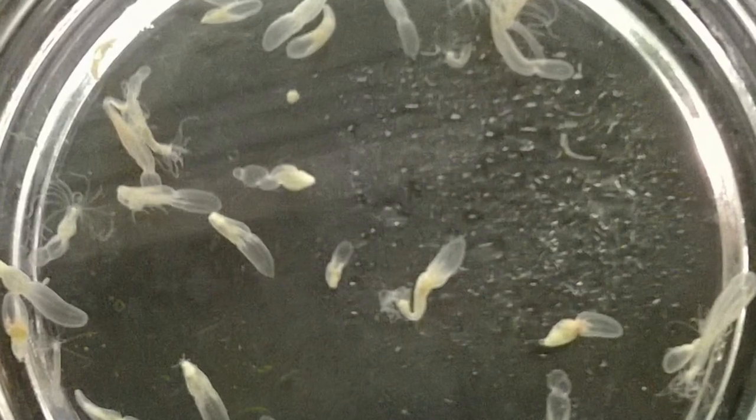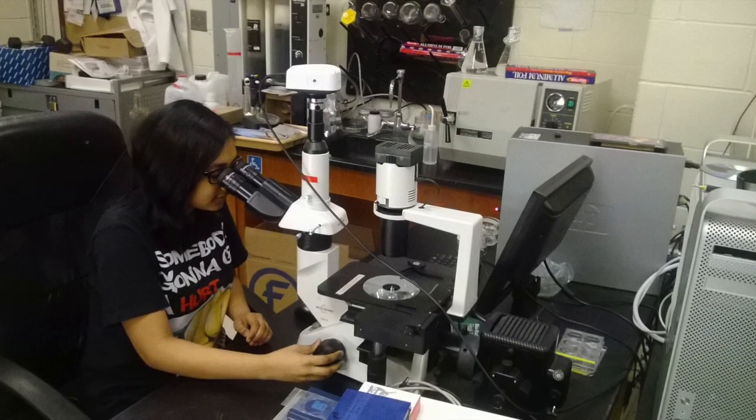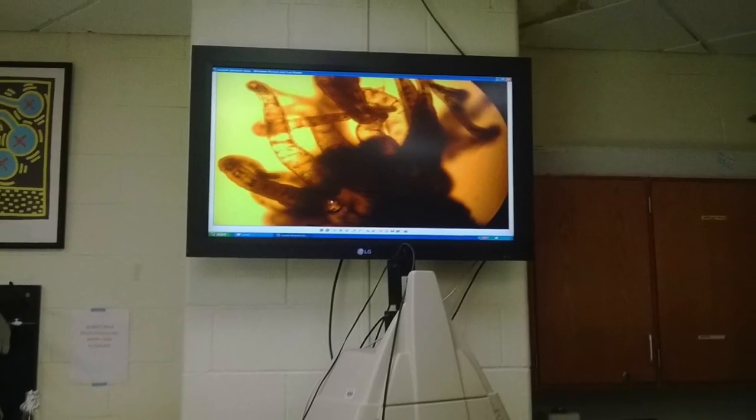My partner and I collect data with a microscope and a computer. The microscope is hooked up to it, and you can see anything you see through the scope on the monitor of the computer, and on a flat screen that we have mounted on the wall.